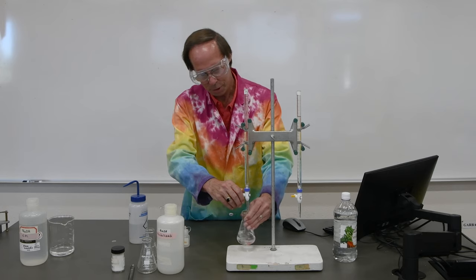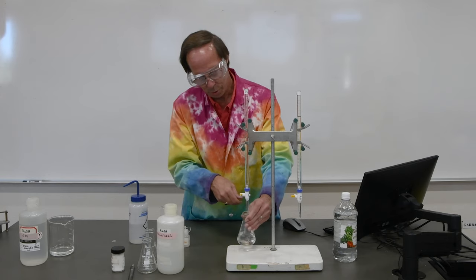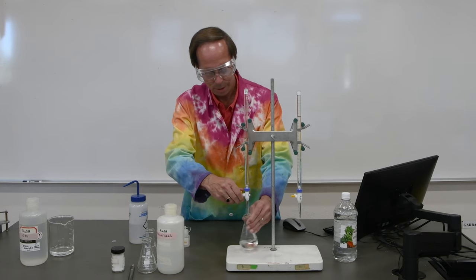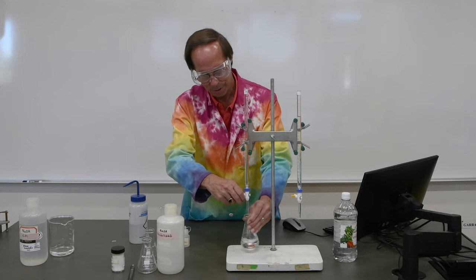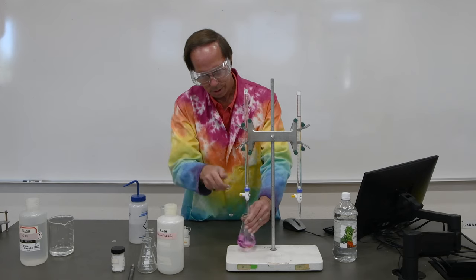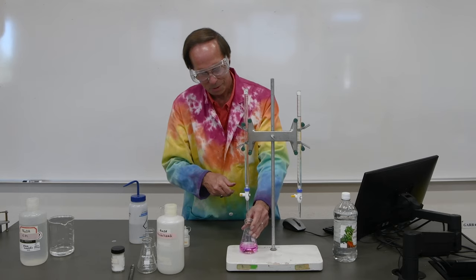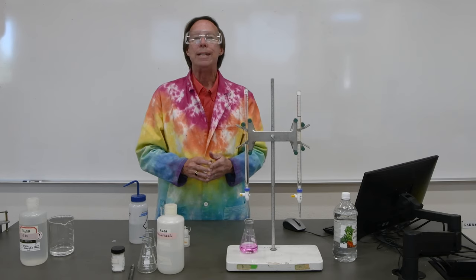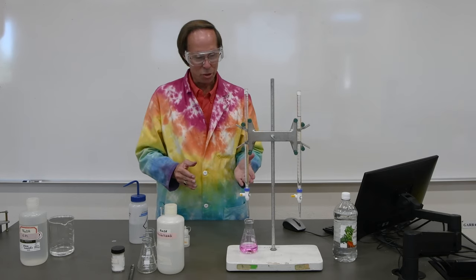See, little bits of pink color in there, but no permanence yet. Looks like we're getting closer. All right, we're getting real close. The pink just about stayed there. We'll let it drip in here. Yes, we're getting very close. And that looks like we've got it. So that'll give us a pretty good idea of where the end of the titration is.